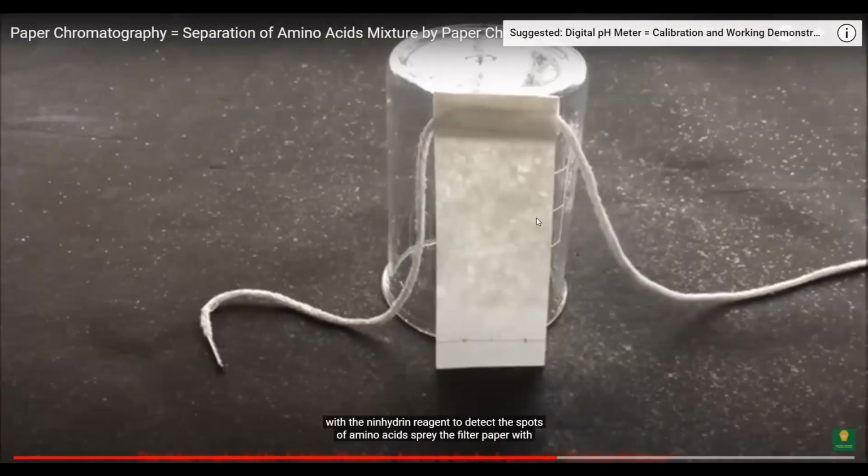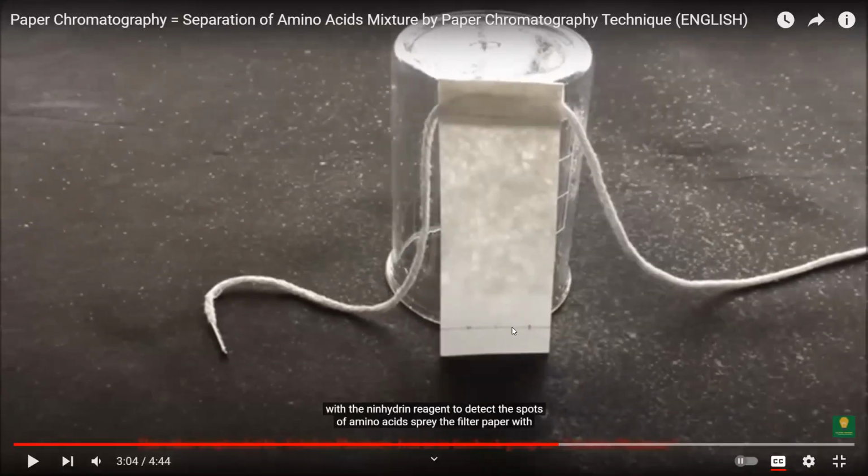Spray the filter paper. If you have amino acids spotted, then there are different reagents that are used to develop. Similarly, in the olden days, you had cameras where you would fit a roll in there, and then you click photos and you give it in the photo lab or the digital lab where they develop. So developing is another process. So here also you have to develop. How would you do that? If you have amino acids, you have to spray ninhydrin reagent there.